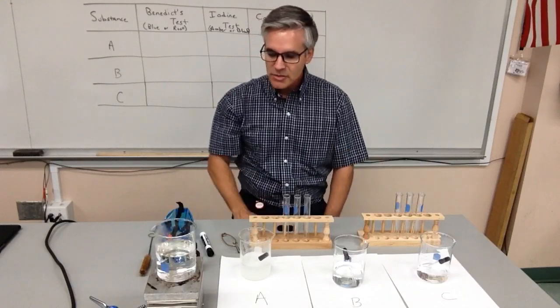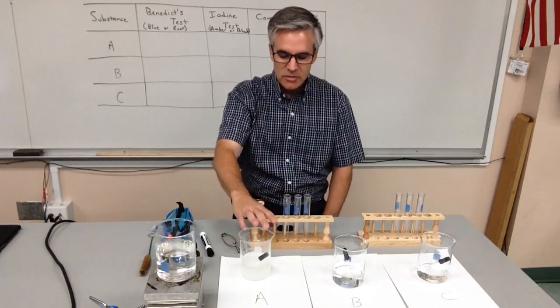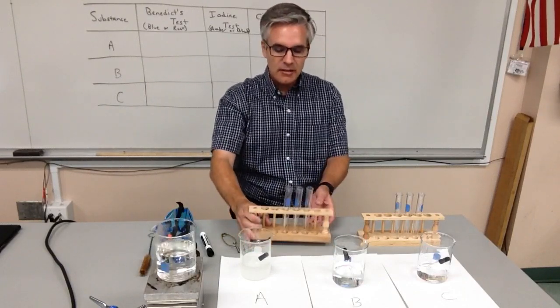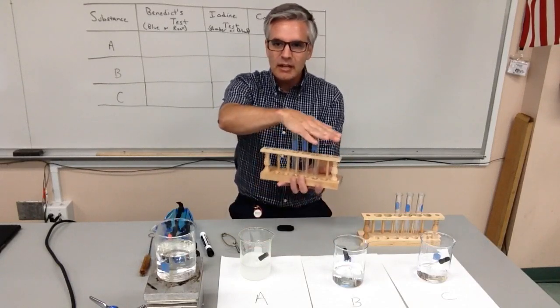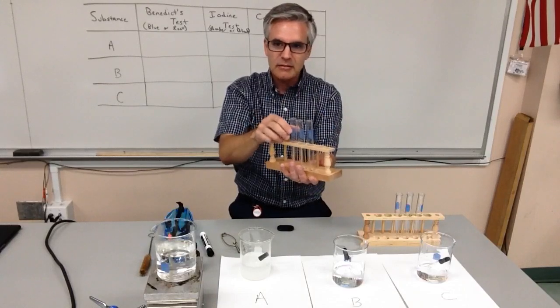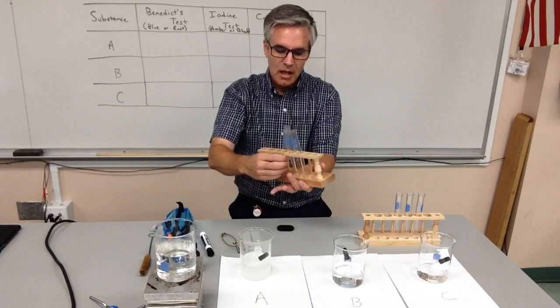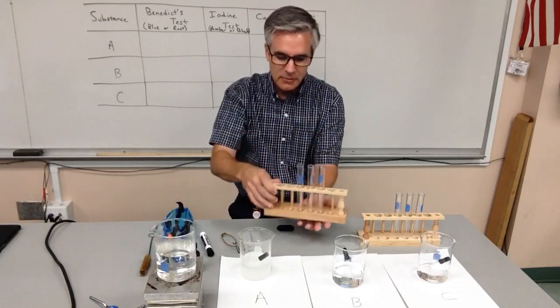For safety, we are dealing with test tubes and test tube racks. If you were in class and had to carry these around, you would have one hand on the bottom of the rack, one hand on top. That way nothing could accidentally slip out of the rack. If we carry it like this, they're loose in there and shake around, and something could actually slip out. We don't want that to happen. So we want to make sure we're carrying these carefully if we're in class.